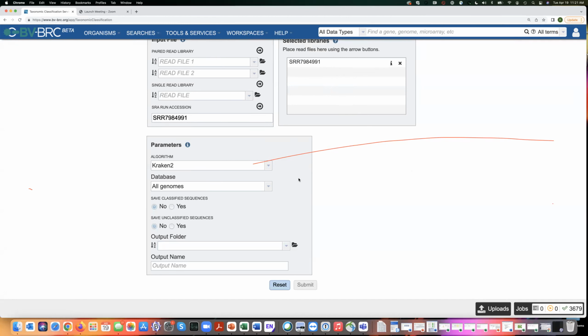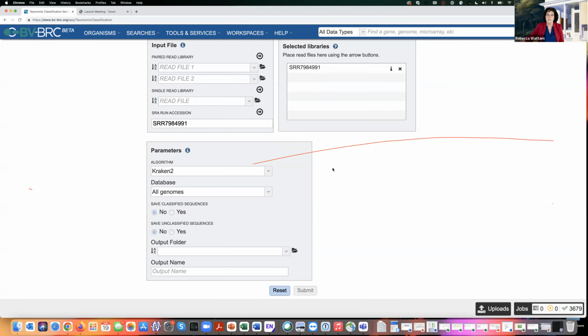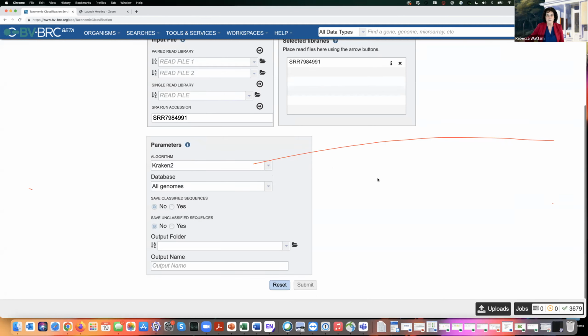Okay, so the answer basically is that there is a way to do it using the command line, but using the web interface, that's underdeveloped. You can do it 192 times, which would be absolutely not easy. The easy way in the web interface is under development basically. Right. Hopefully will come at some point. But for now, there is a command line option if need be. It's being asked more and more frequently, so it's become such a problem now of me having to ask the developer to do it independently that we were going to mention it, that we needed to do this right away, because I'm tired of pulling people off task to do it. So hopefully it'll come sooner.